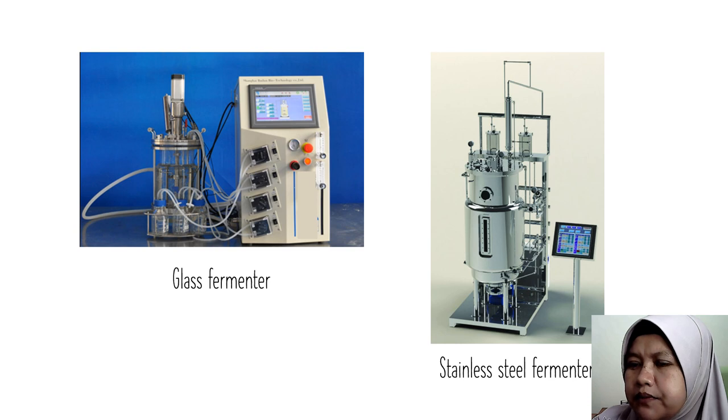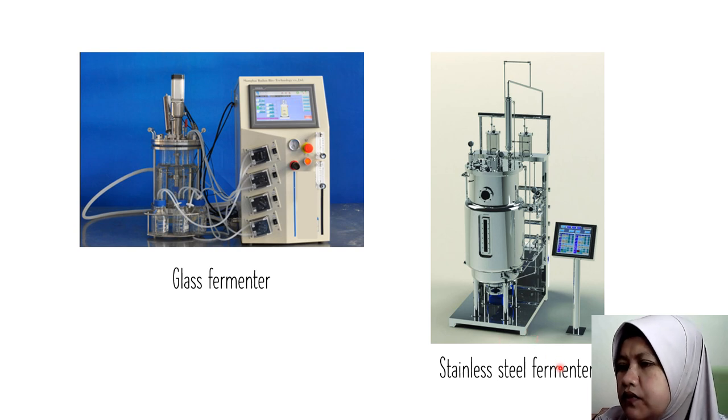And this is an example of what we have in the lab, which is a glass fermenter, where they are equipped with several probes here connected to the pump, a series of pumps here. This is the pump to control inlet and outlet of the medium into the vessel. And this is the controller. Okay, here is the stainless steel fermenter, which we normally use at pilot scale.